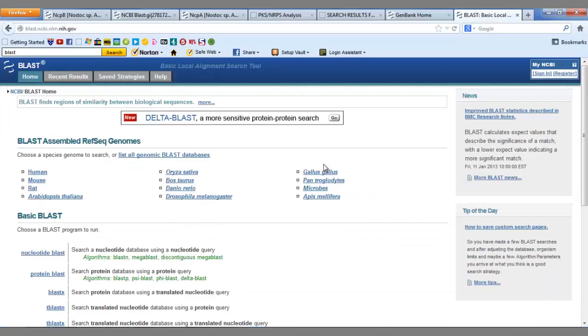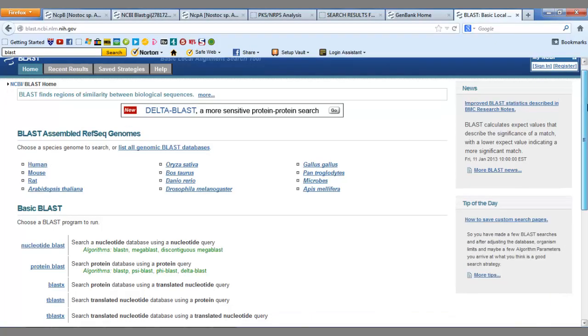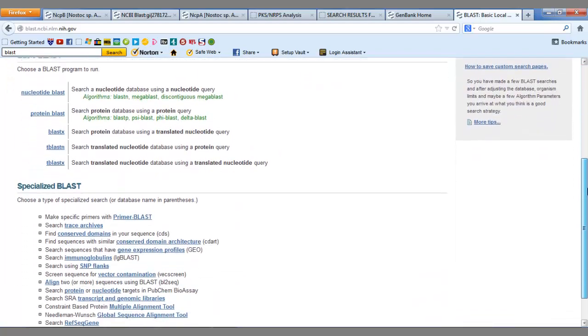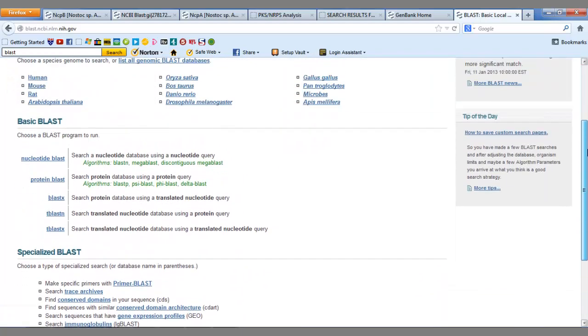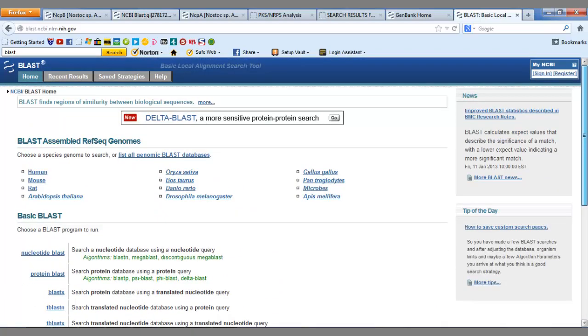BLAST, or Basic Local Alignment Search Tool, compares regions in the entered sequence to a large database of known sequences to see if there are any matches.